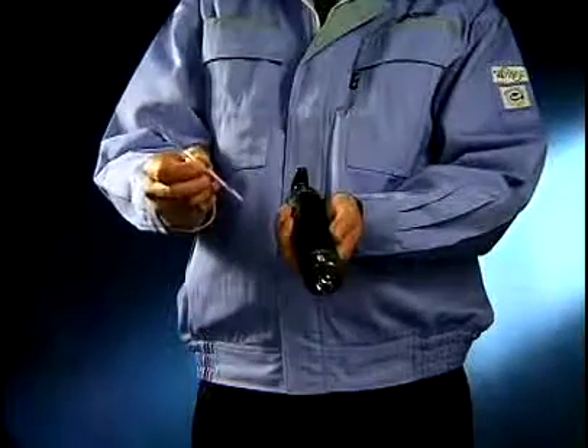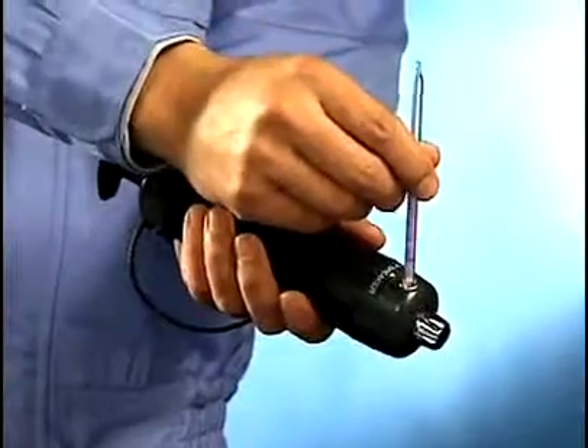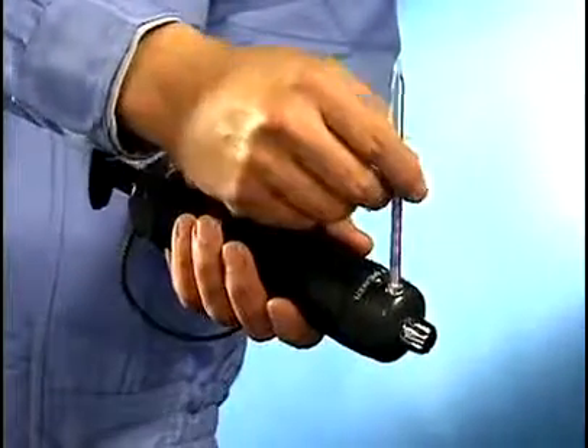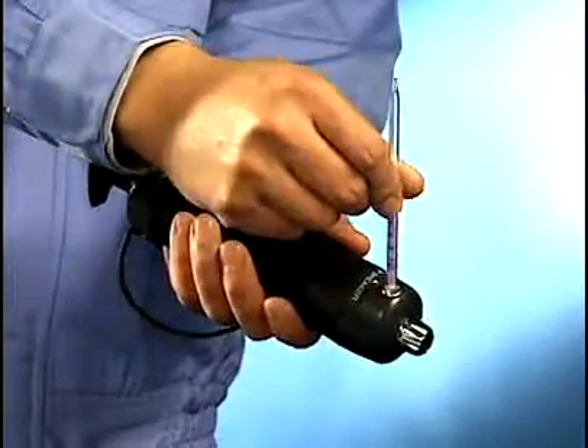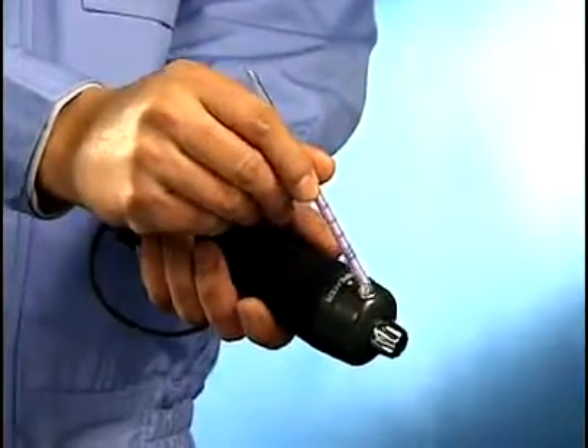An unused detector tube must be used. Insert the detector tube in the tip breaker. Turning it around lightly for four to five times makes an incision in the tip. Now simply bend the tube towards you to break off the tip.